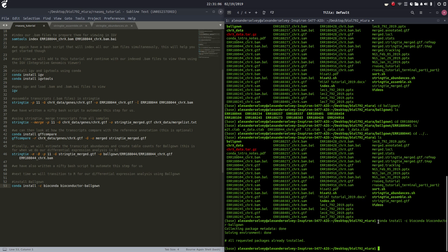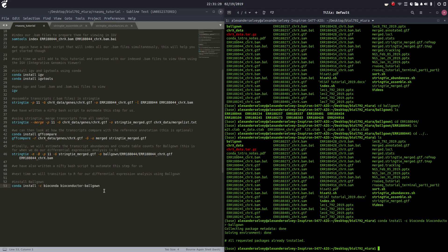Just another great use of bioconda, which is a package in miniconda. Install miniconda and have the world at your fingertips, essentially, when it comes to downloading and installing bioinformatics tools in a very timely fashion.